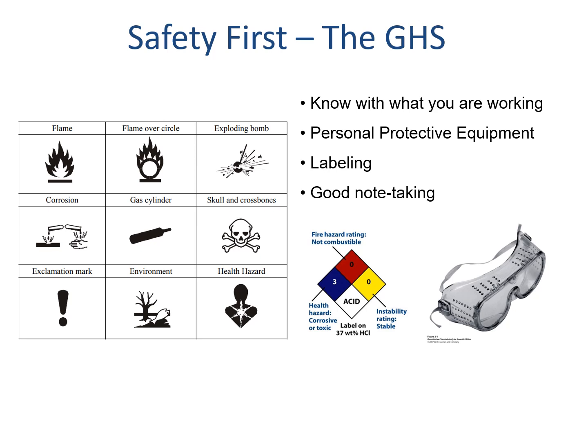On primary containers, these risks are often indicated with the GHS, or Globally Harmonized System. These symbols are meant to give you a very visible indicator of what you should keep in mind when using a reagent or disposing of its waste.